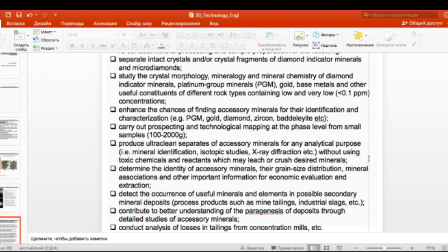So this approach has been used successfully, for example, for discovery of 6 new platinum group minerals during the last 10 years. And this is the only way to characterize grains of platinum group minerals from the host rock. All other platinum group minerals, before the invention of hydroseparation and electric pulse, were discovered in placer deposits.